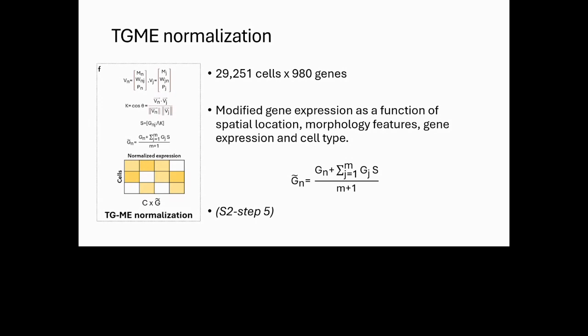That's what we pretend to do. We can think that this is what the pathologist will do. They take the data, look at the slide, and start defining: these regions are the tumor, we see a border, and we see a section that is the vessels. That's what the algorithm is doing, but with no information at all of the biology. It's just the data sets that we have.